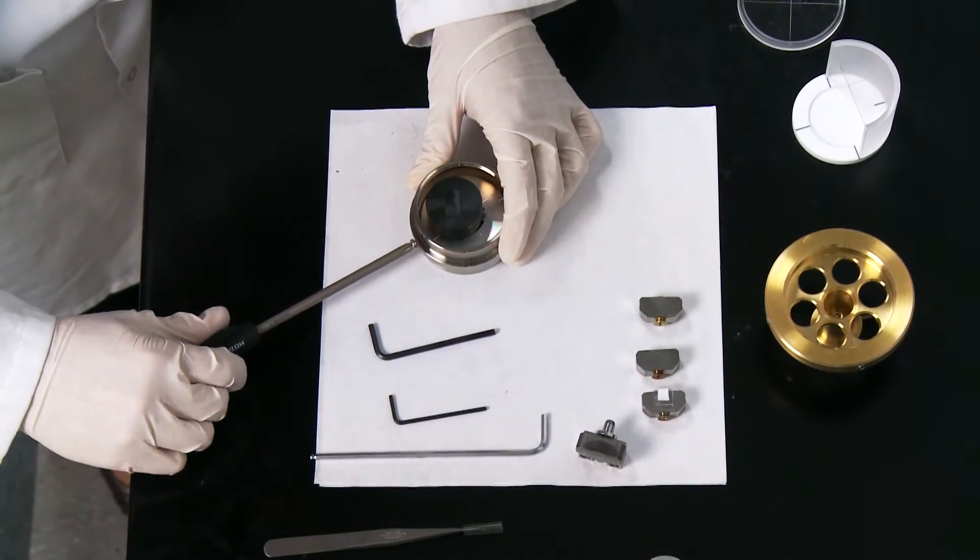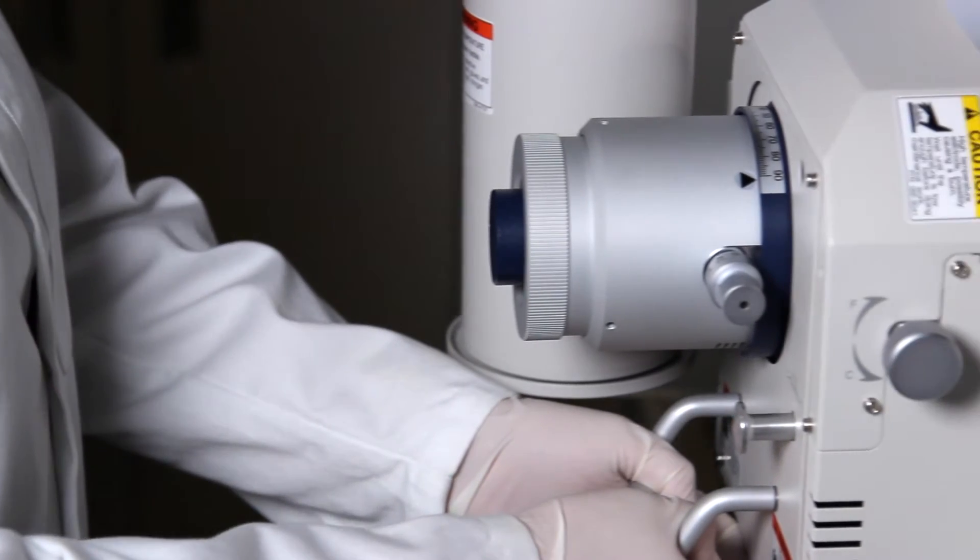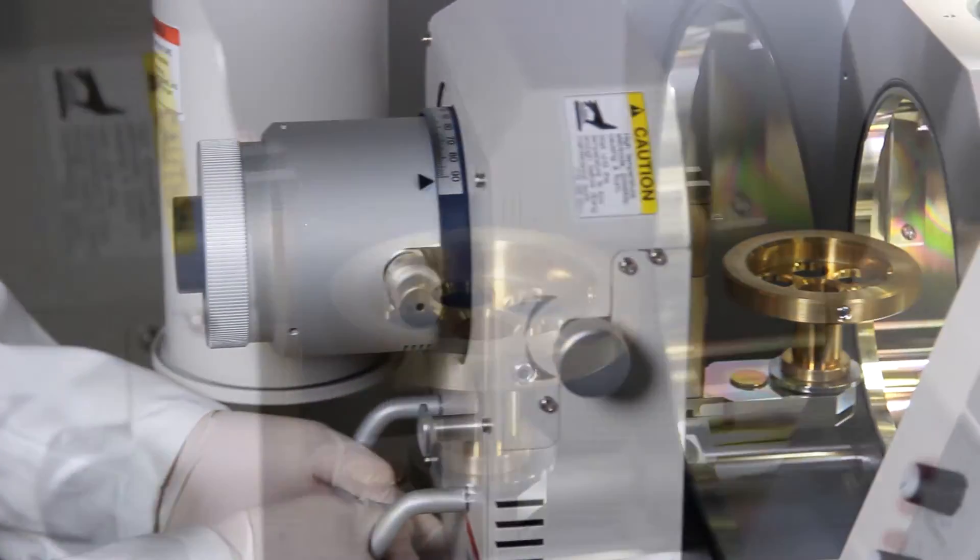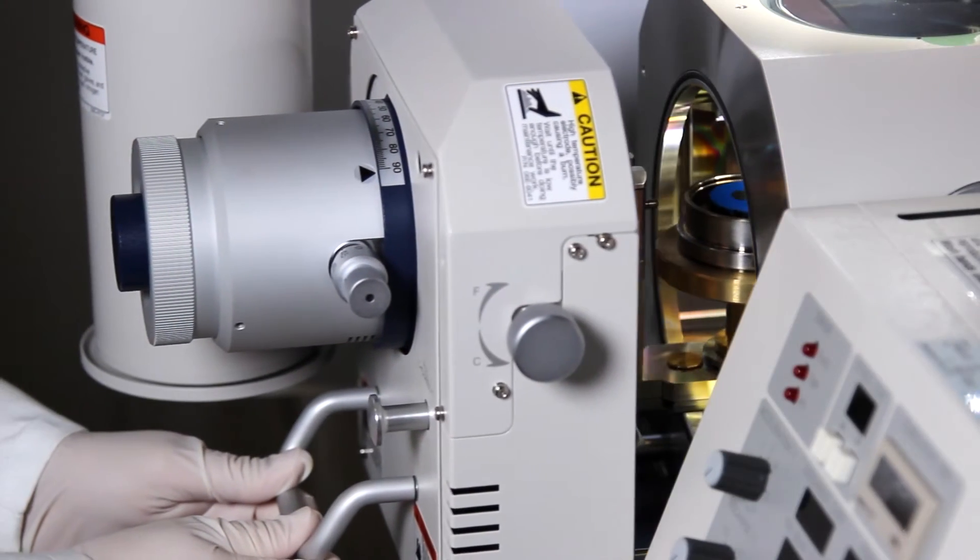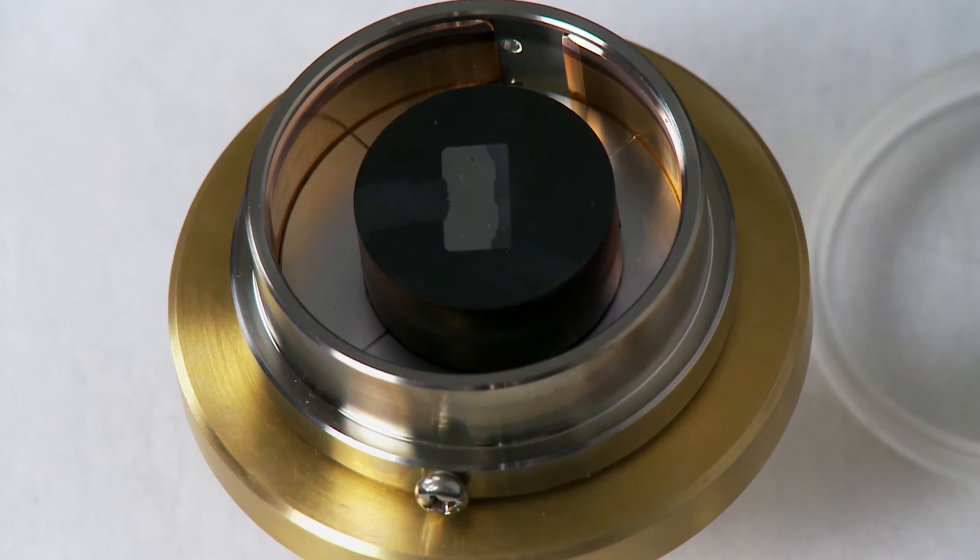True to its heritage, the Ion 4000 Plus is able to uniformly polish a large sample area of more than 5 mm in diameter in the flat milling configuration, with variable angle milling to selectively enhance specimen surface features.